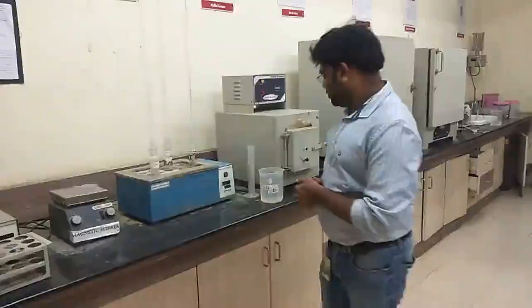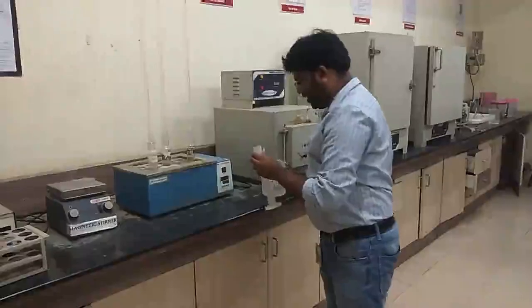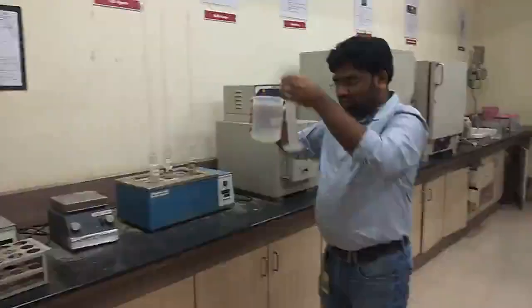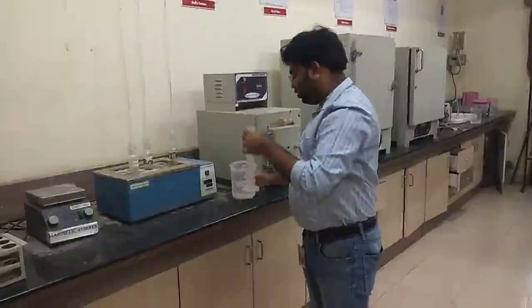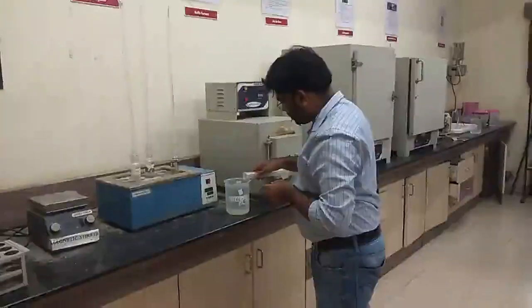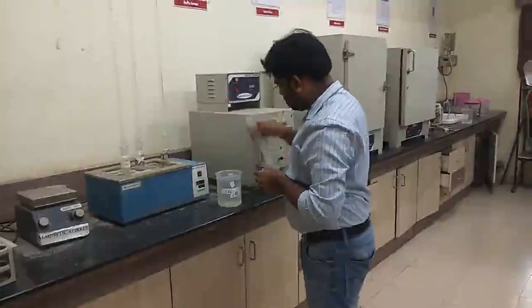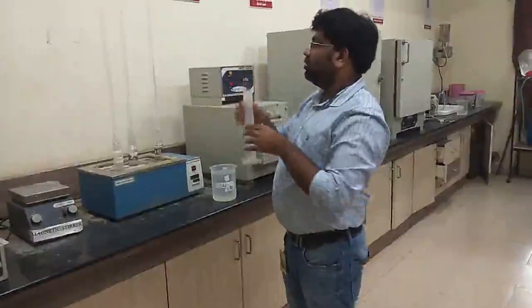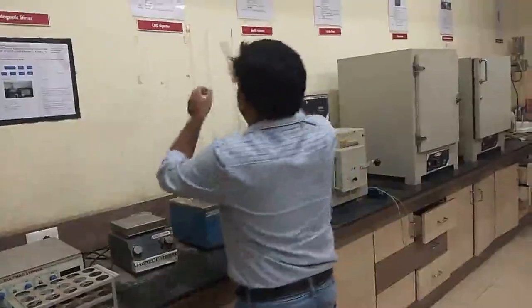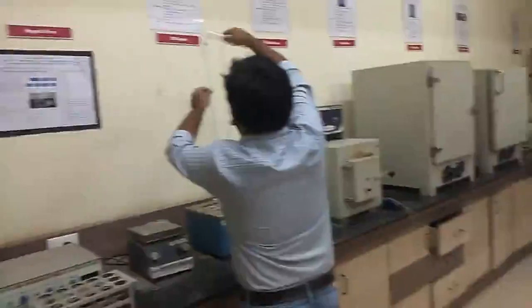So we are going to add 20 ml of distilled water into each of these COD digestion flasks through the reflux condenser. All of it will get settled. Here I'm adding it slowly.